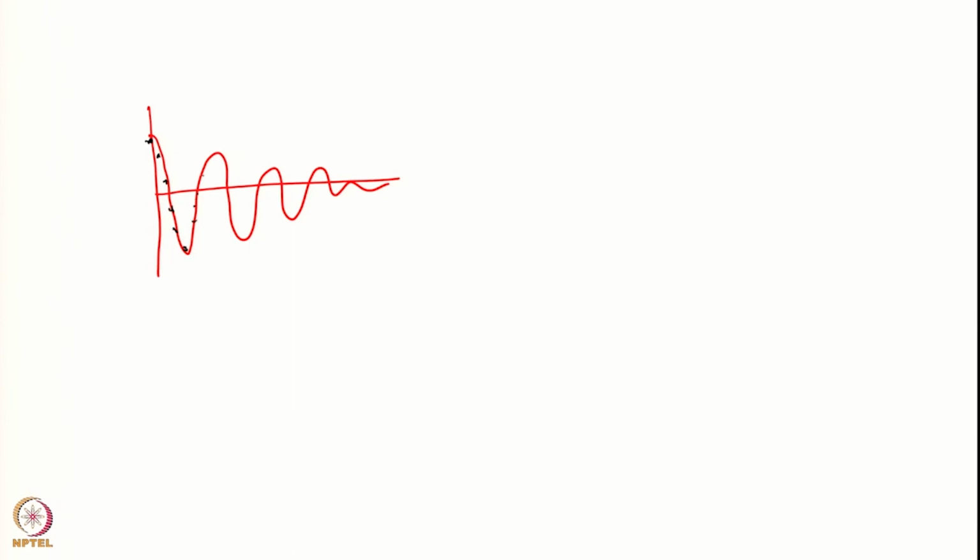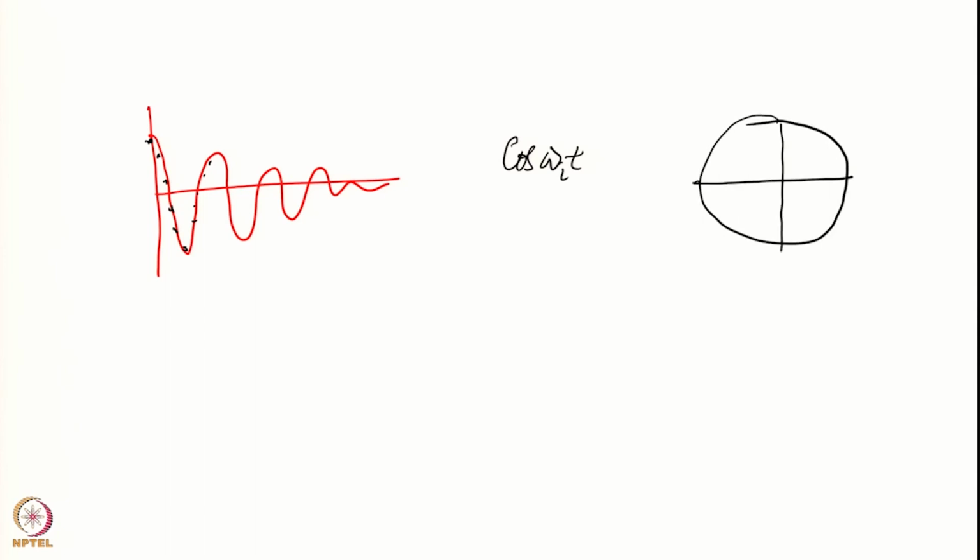So at time t equal to 0, the magnetization is entirely along the y axis, if I am collecting the y components. But suppose I cause a small delay in the acquisition of the time. So in this situation, where will the magnetization be? All the components of magnetization will be along here, all the components. In the normal case, this is.